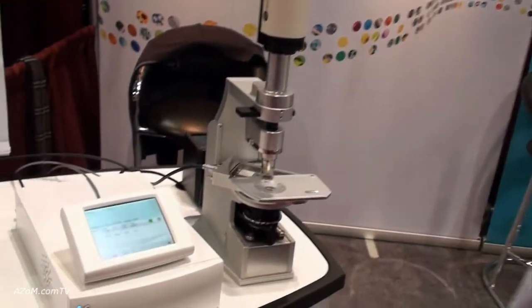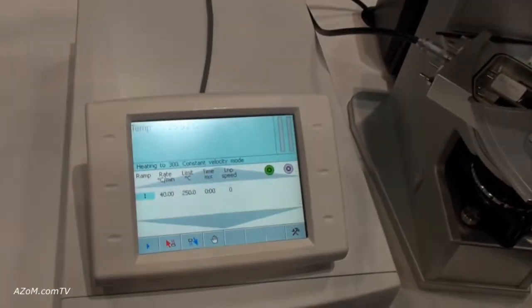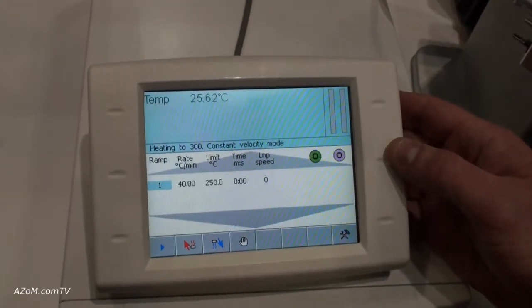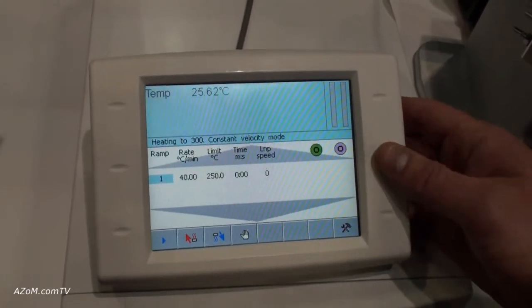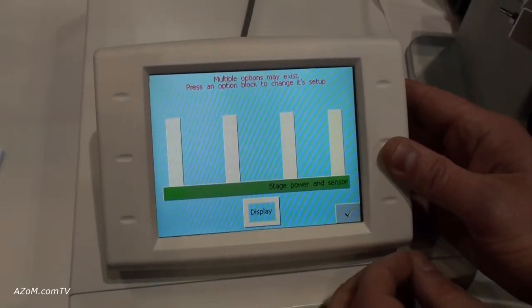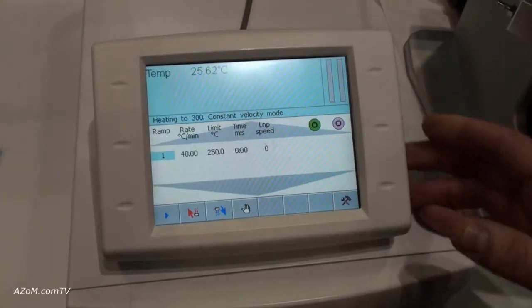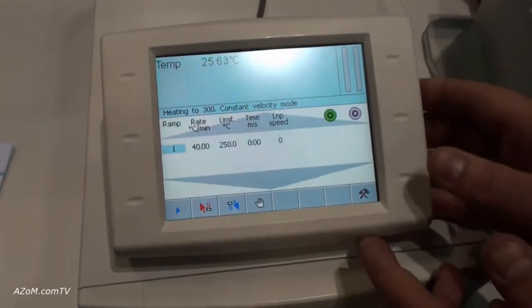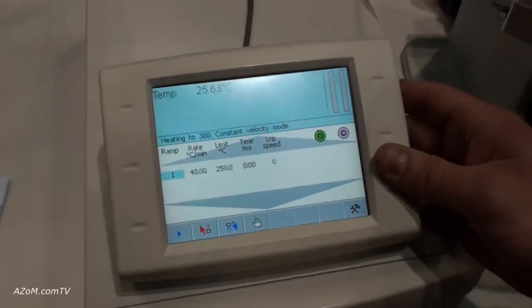As Cameron mentioned, Linkam has a brand new T95 temperature programmer used to control a variety of their thermal stages. We have it on display here. This is the first time it's being released at Pittcon 2009, and what Linkam has done is they've modified their temperature programmer to offer this ergonomic touchpad control screen. I can control up to 150 different temperature ramps, and this will in turn control my Linkam thermal stage.